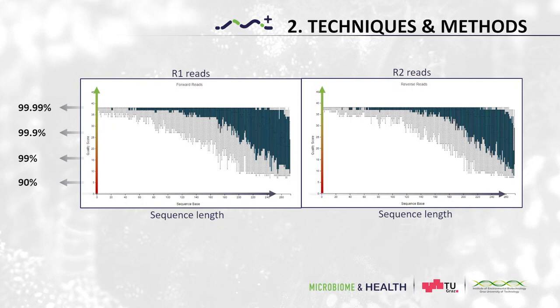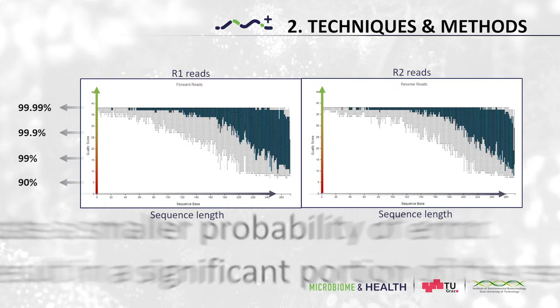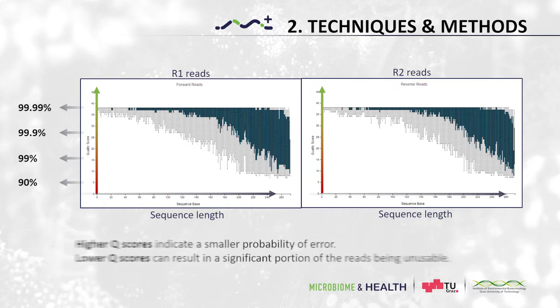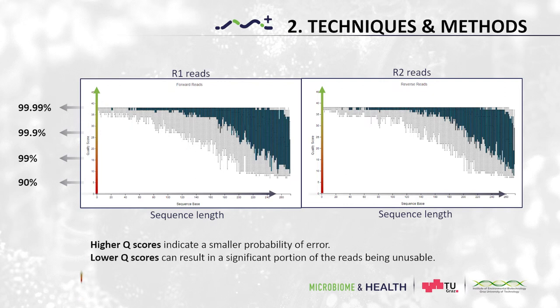We use this information to decide where to truncate or cut the sequences to remove bases or parts of the sequences with low quality. This is important so we can have confidence in the downstream analysis.